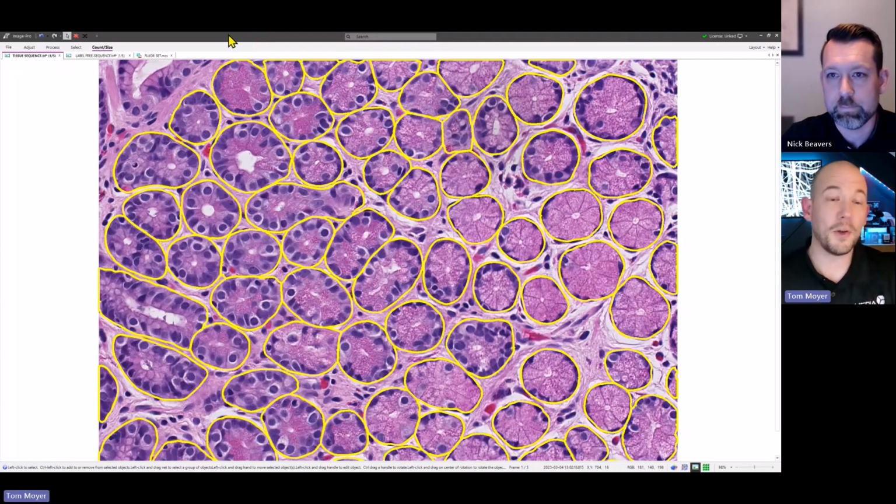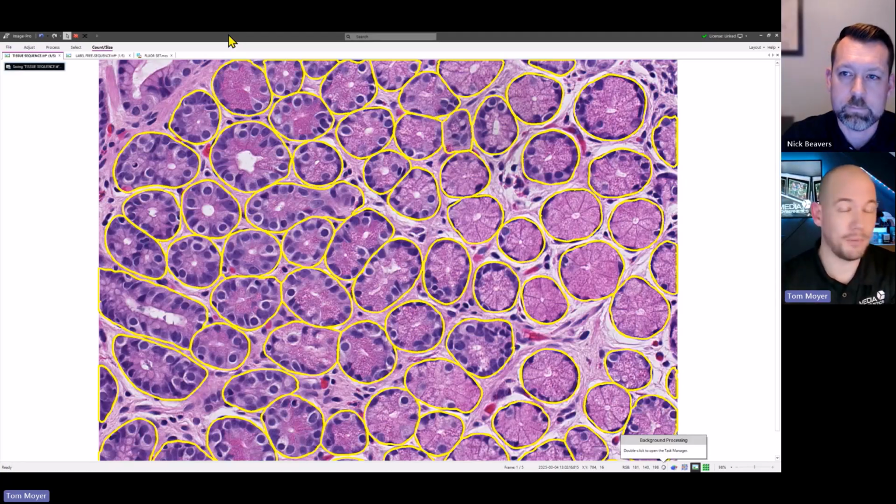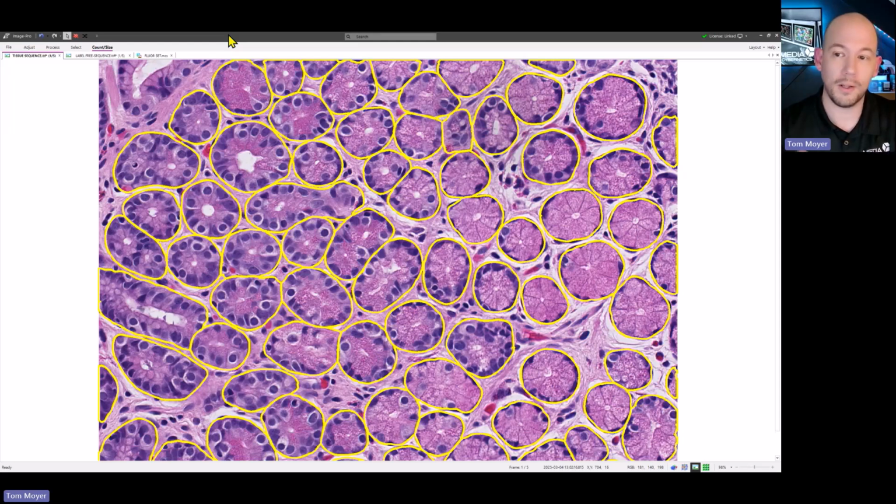Excellent. All right, so moving on to automating the workflow, we've touched on AI deep learning and how that can improve efficiency. But AI deep learning is, simply put, a segmentation technique. We have found objects within the image. We have outlines, a nice, pretty picture that we can print out and put on our wall. But most of us probably want to extract and compile data with all of our images.